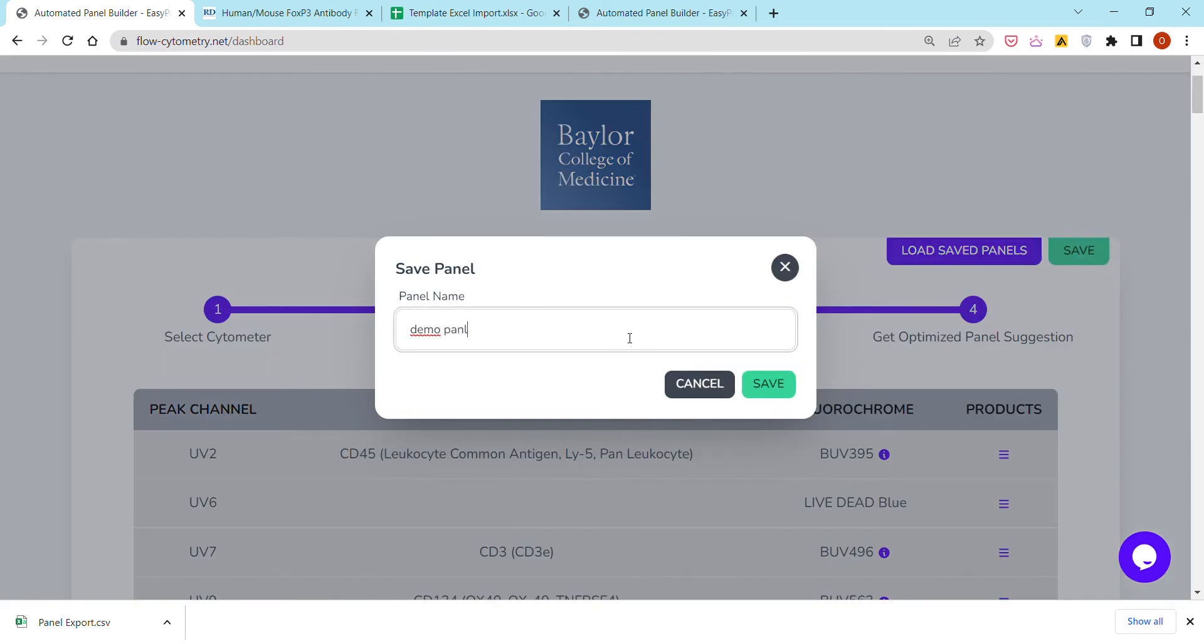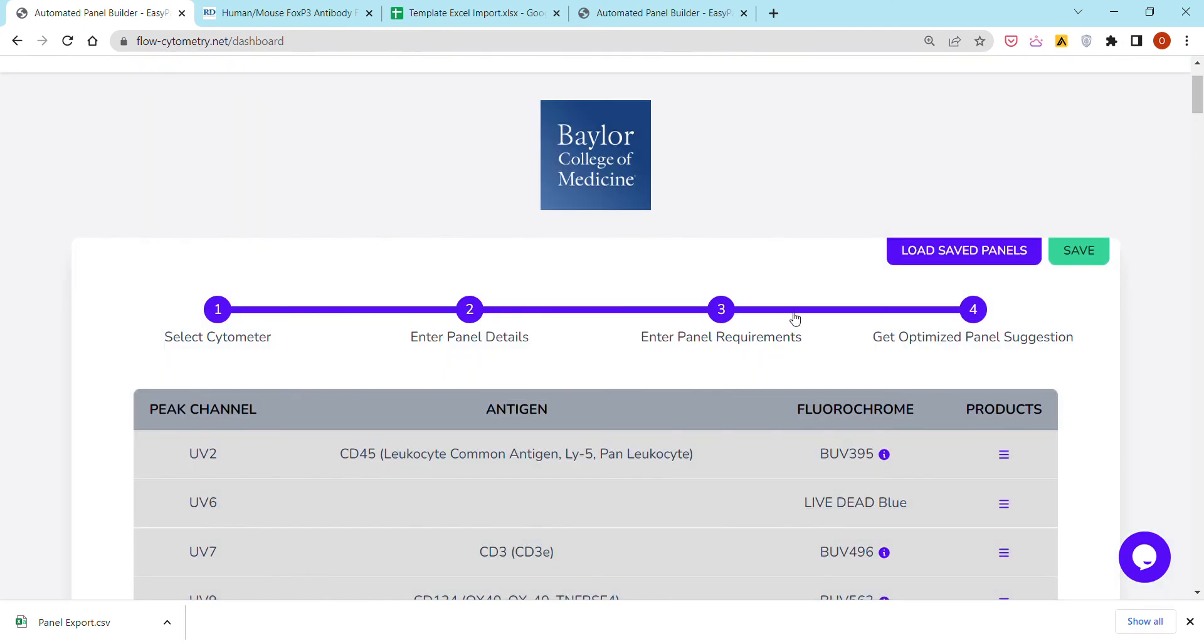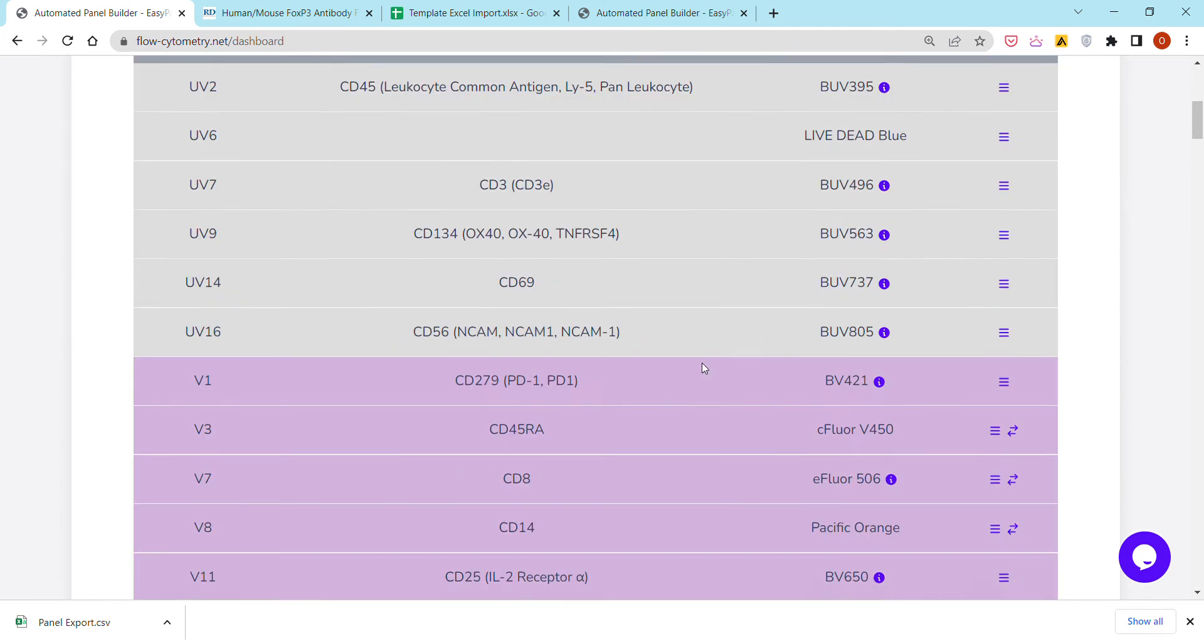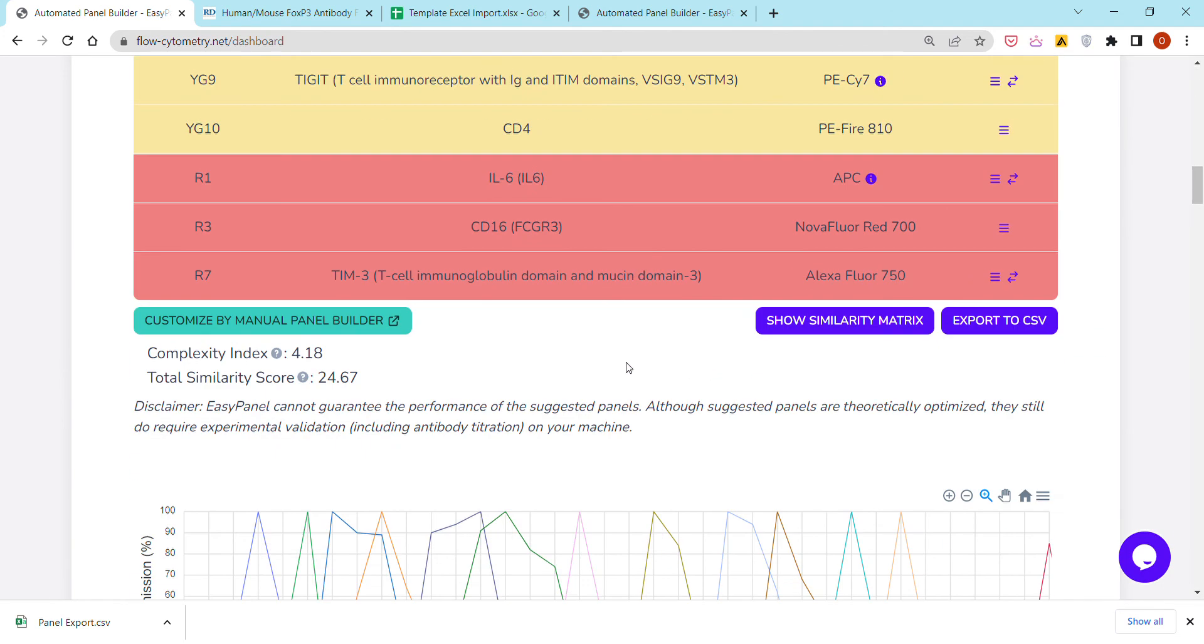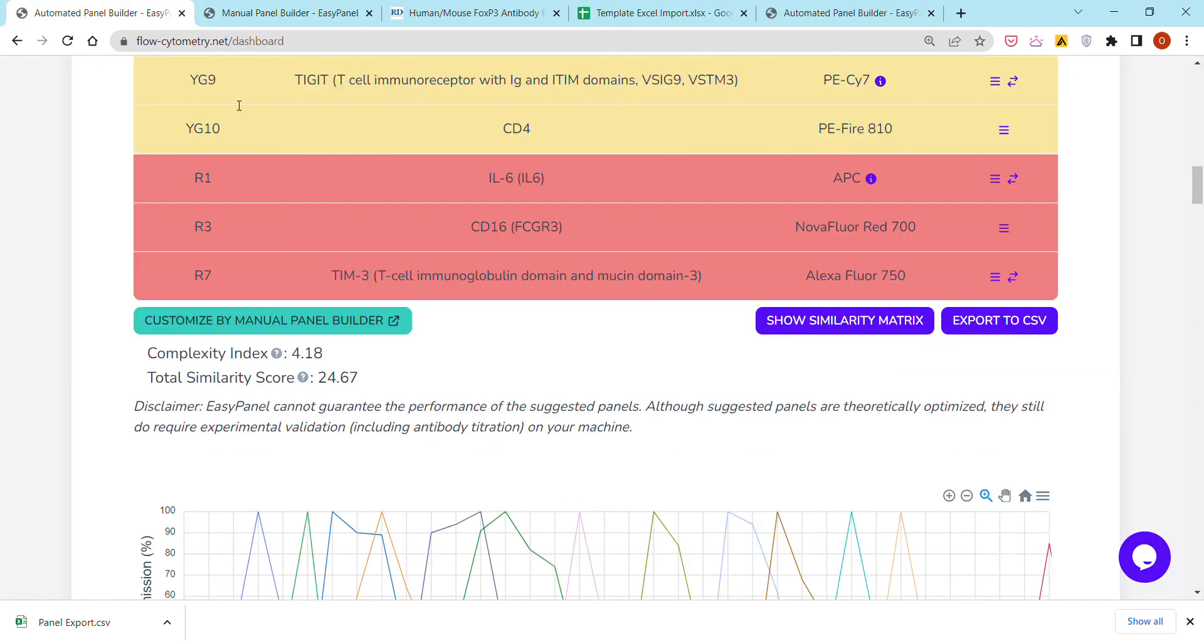As I'm doing here. There are a few other features that I can explain in later videos. Maybe the most important is customize the panel by manual panel builder. You can check this button, and in case you are not satisfied with any of the suggestions, you are welcome to make fine edits or fine tunings.